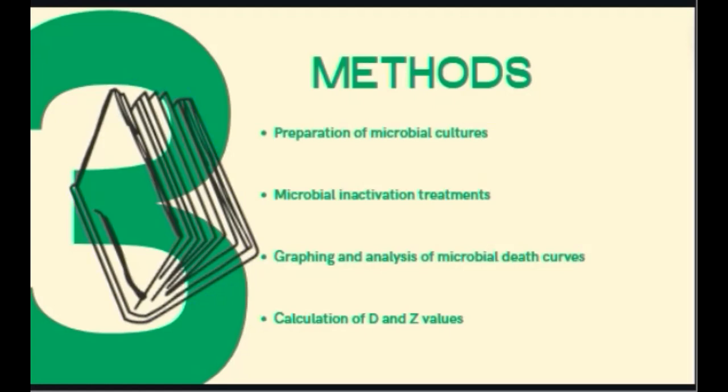Then, incubate the culture at the optimal temperature for 24 hours to allow the adaptation of the microorganisms to the culture medium.